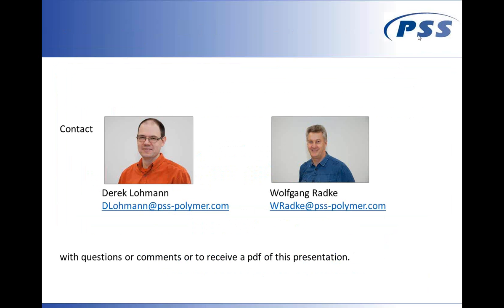There's one question you mentioned in the beginning when you talked about isocratic chromatography. You mentioned very low molar mass where isocratic chromatography is feasible, for example, for polyethylene glycols. What molar mass would you consider very low molar mass with respect to that, where isocratic chromatography would actually work?